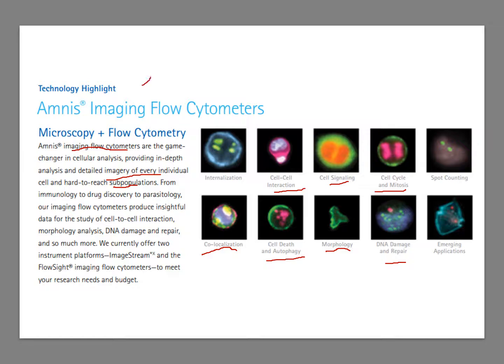So that's probably one of the newest machines that goes beyond just the flow cytometer and the FACS. It's called an imaging flow cytometer. So they combine the characteristics, and they've added now sophisticated imaging, which you would predict as techniques change. This is the first time I've seen this, so it's probably a fairly new machine. Very interesting, the workup you could do if some students had inquiries to solve down the road.